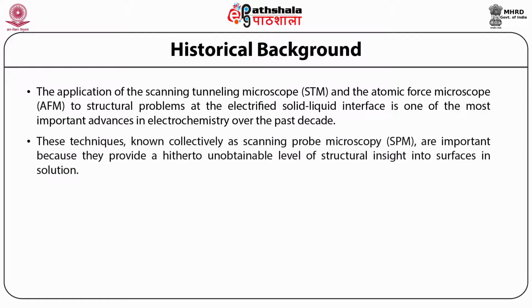These techniques, known collectively as scanning probe microscopy, abbreviated as SPM, are important because they provide a hitherto unobtainable level of structural insight into surfaces in solution.